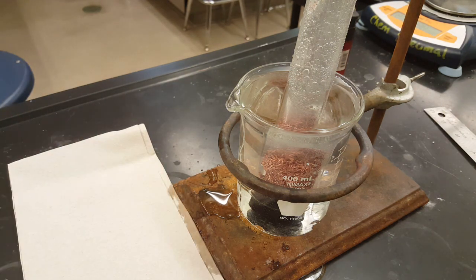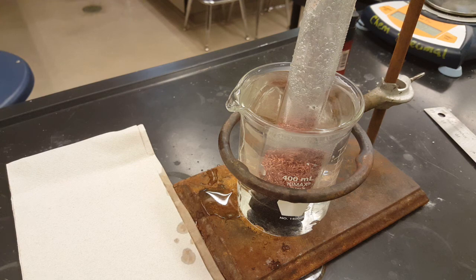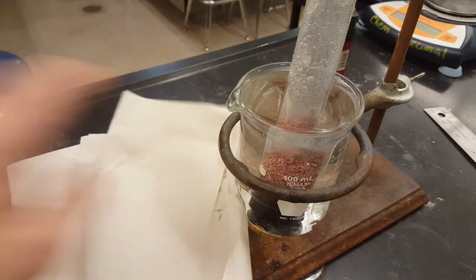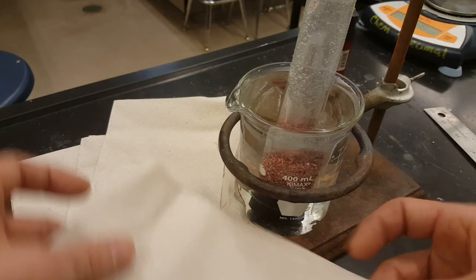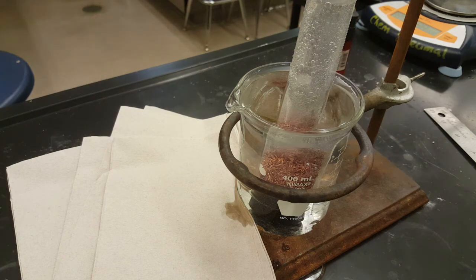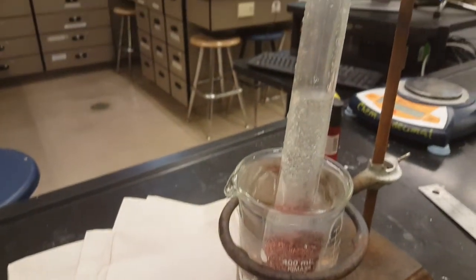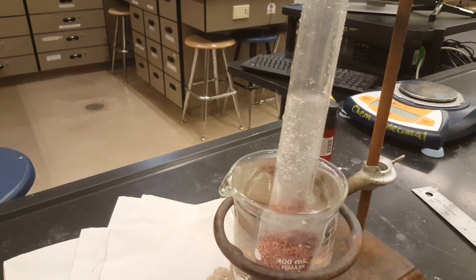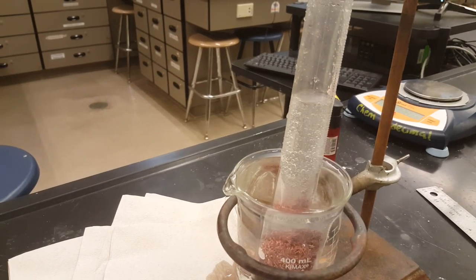The acid is so diluted at this point, don't worry about baking soda unless you think you've spilled the undiluted concentrated hydrochloric acid. Put some paper towel around your beaker if it's overflowing, and just wait for the graduated cylinder to fill with gas until the reaction is over.